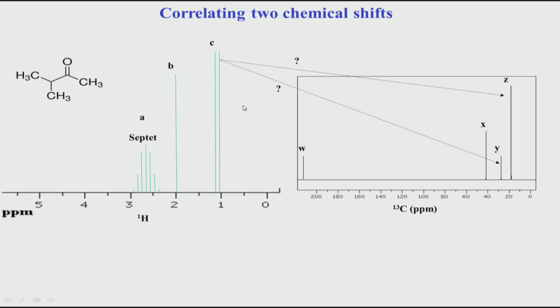In the next slide we will see a simple 2D, but we will not see how the 2D is recorded right now; we will come to that later. So, let us now look at how a 2D can help for this problem. What is the problem in hand? The problem in hand is as follows.